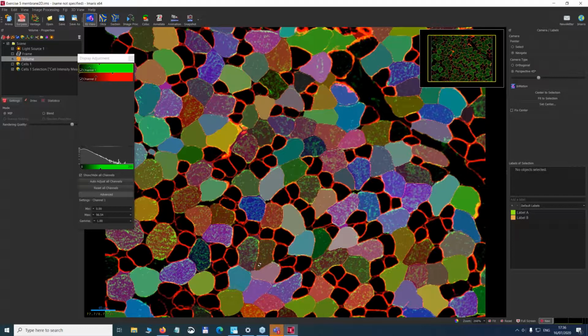As long as that membrane label is staying and is different than the label for the calcium signal, so they're two different channels, then yes, it should totally work. And then you're going to get a readout of intensity changes over time with that. So it definitely should work. Again, to get the specifics on exactly how you would do your particular application, I would ask you to reach out to our sales and support teams that are there taking care of you locally.